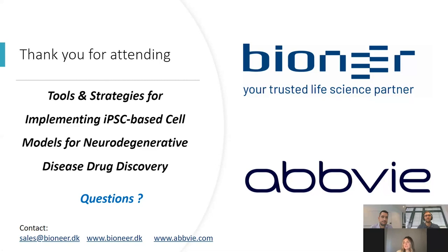Great, thank you. Next question here is for Peter, and this question asks, how do you ensure reproducibility when differentiating iPSCs to reduce variability, for example, batch to batch?